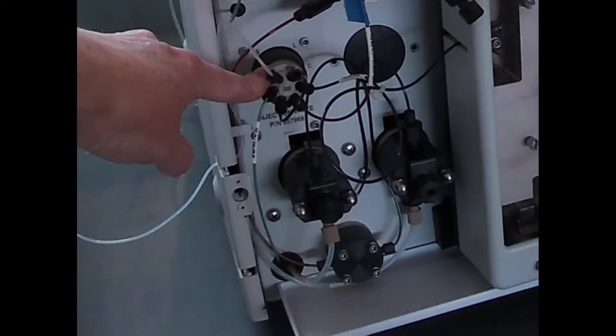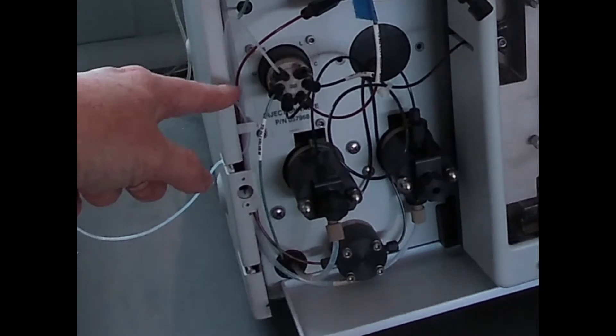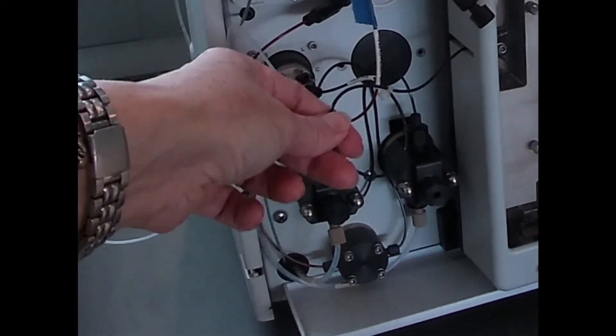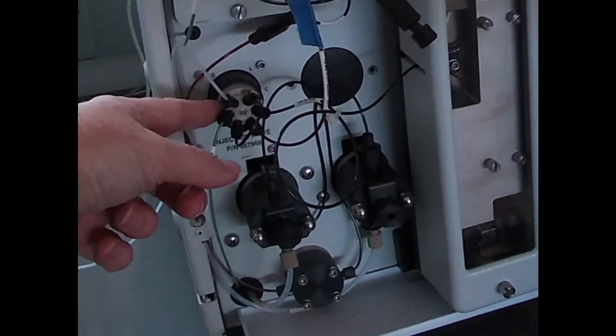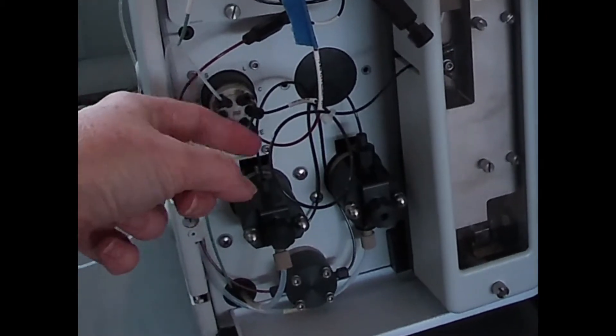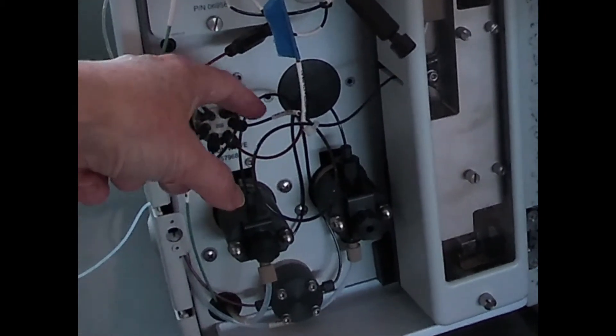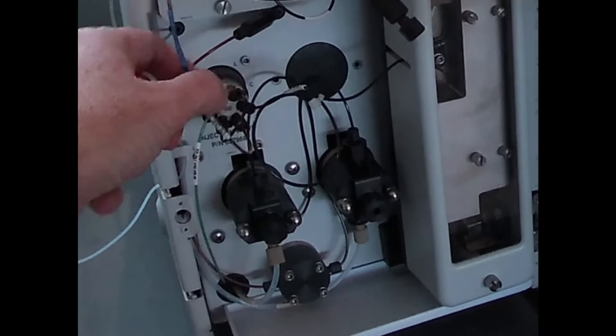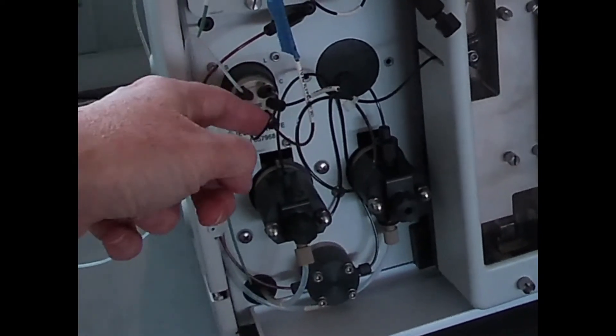This is a selector that allows us to either be pumping eluent directly onto our column, or we can change the direction to push our sample out of the sample loop and put that on column. So our injector allows us to get reproducible amounts of sample injected.